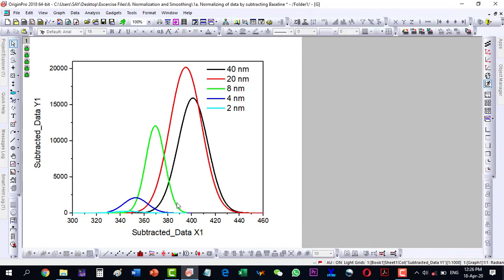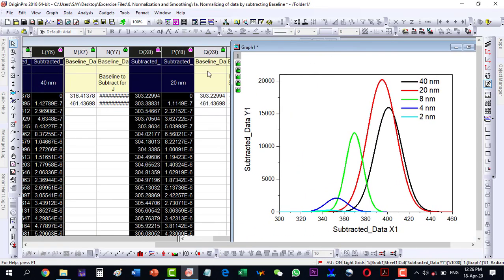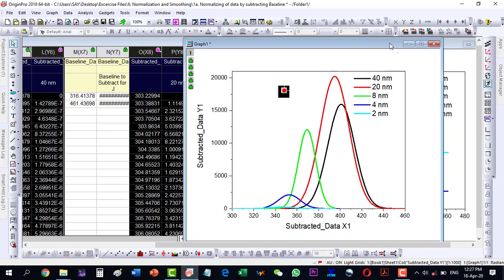I select OK and the plot is ready. We can see that 2 nanometer has come down and 4, 8, and the others follow, but the order is reversed here. If we want to make them in order, we can create another worksheet and paste them in order. This way we can do it automatically with the baseline subtraction method.